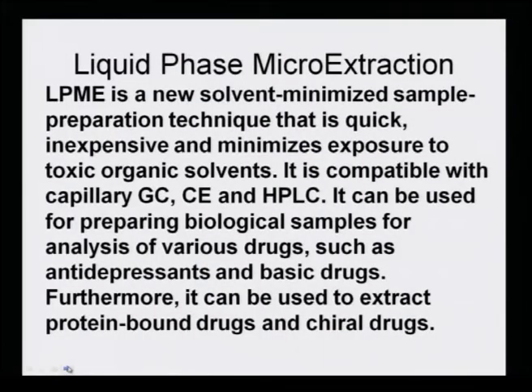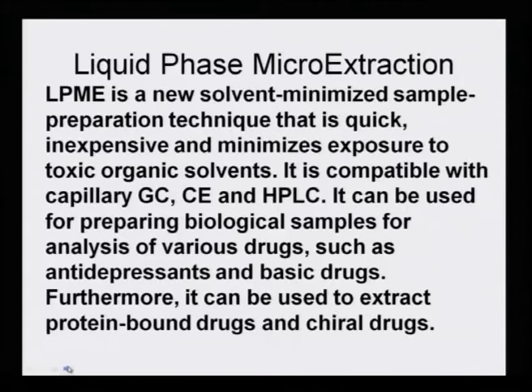Liquid phase microextraction. I am coming to more and more recent methods of extraction for the simple reason that now many new techniques have come up, and they depend on the fact that as and when there was a need, and if the classical methods were not one of the best methods for extraction, a newer method was devised. And one such new method is called liquid phase microextraction.